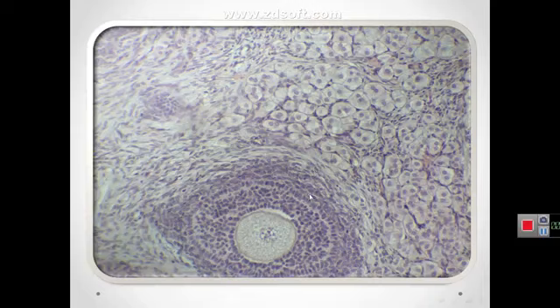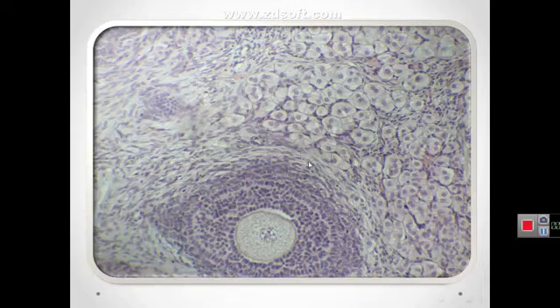The theca interna is a well-vascularized endocrine tissue with typical steroid-producing cells secreting androstenedione. A more fibrous theca externa contains fibroblasts and smooth muscles and merges with the surrounding stroma. Together they form the theca folliculi. The multilaminar primary follicle consists of the oocyte with nucleus, zona pellucida, granulosa cells, theca interna, and theca externa.